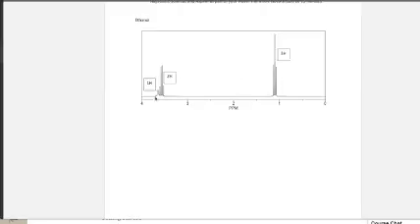The 2H lies around 3.6, which is right here, and as we can see, it has 4 signals, so it is going to be a quartet, and this usually represents a CH2, but I will explain why it is down here instead of over here, because CH2 is usually around 1.7. And then the 1H seems to be around 3.7 ppm. And this represents an alcohol based on the spectra given.